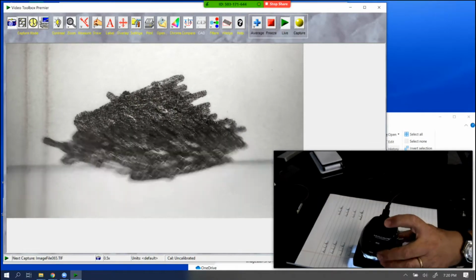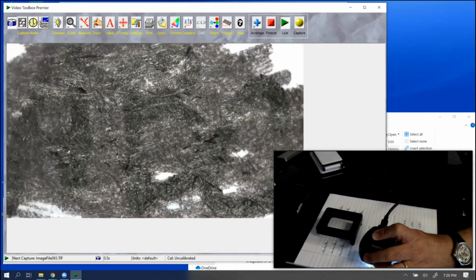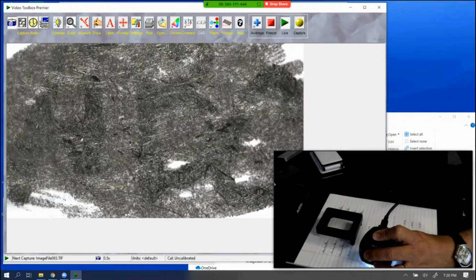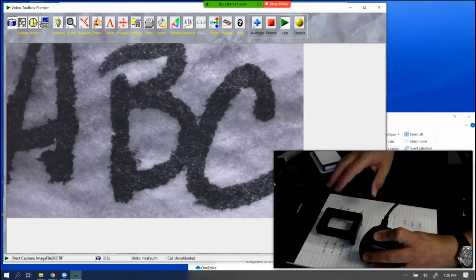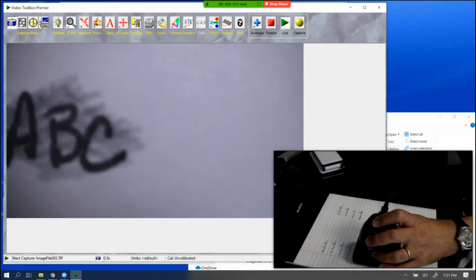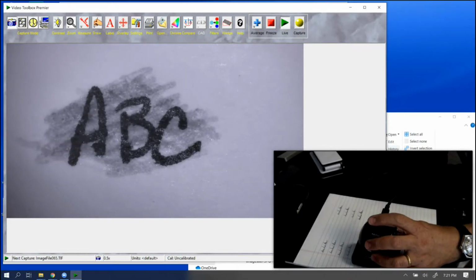That is, how can I determine if there is something beneath that at higher magnification? Might be able to make out something there, but it's possible in switching to a different wavelength that we could look through the obliteration and see something that's underneath.